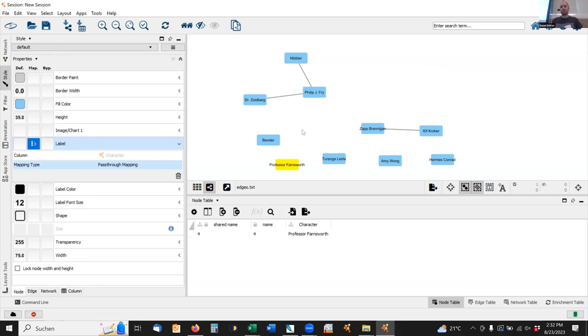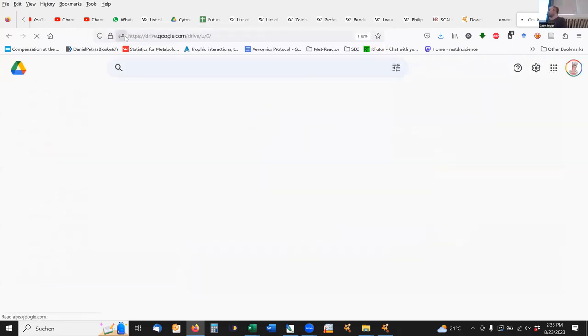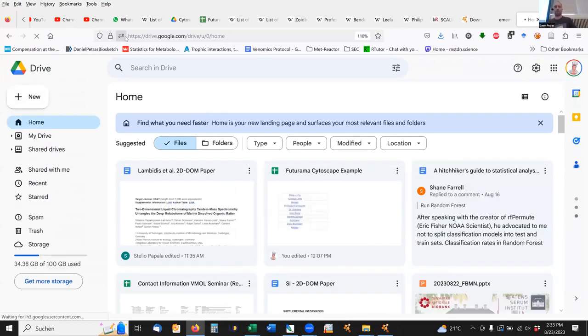So yeah, in principle, you can do this with everything I just said, but for the rest of the course, obviously we want to deal with features for today. So I would suggest that after you have played around with it a little bit, we move on and actually start loading in the GNPS output. Now I do not have a job here, so I actually need to download this. As I mentioned earlier, we had a little server issue, which I think in the meantime got resolved. So hopefully most of you have gotten an email now from GNPS that your job is finished.